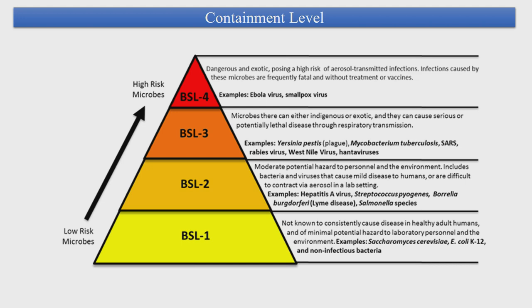According to the pathogen being handled, labs are divided into BSL-1 through BSL-4. BSL-1 pathogens can be managed on the bench side only. BSL-2 has moderate risk — pathogens can cause mild infections and are difficult to contract via aerosol transmission. BSL-3 and BSL-4 require containment facilities and must be handled in a biosafety cabinet. BSL-3 pathogens can cause serious and potentially lethal disease through respiratory transmission. BSL-4 pathogens are those that can be frequently fatal, with no treatment or vaccine currently available.